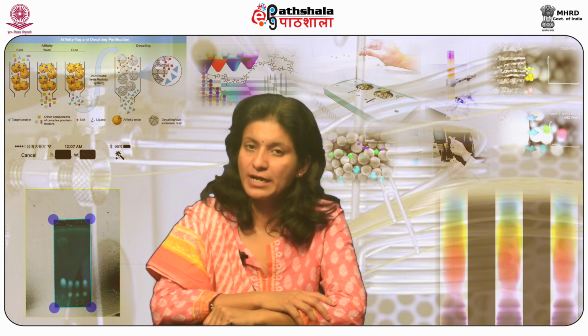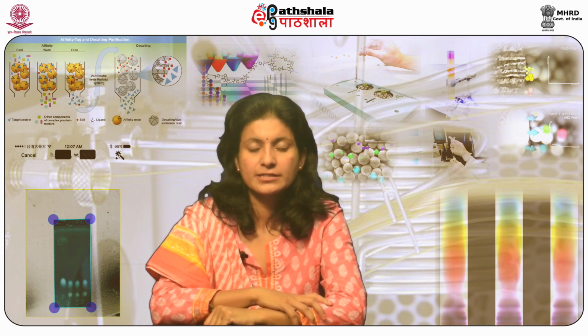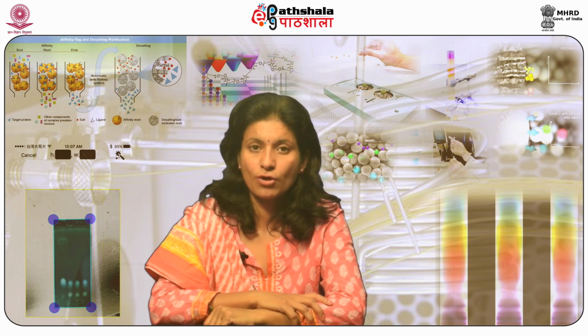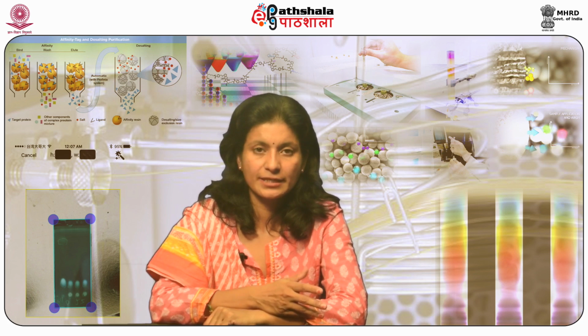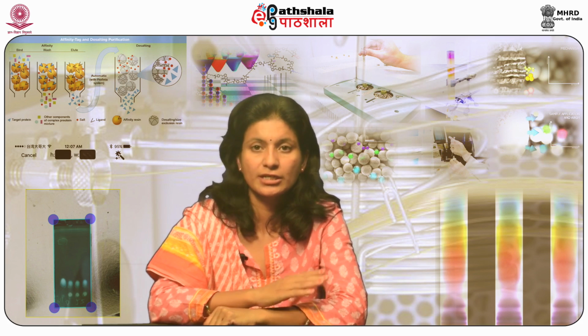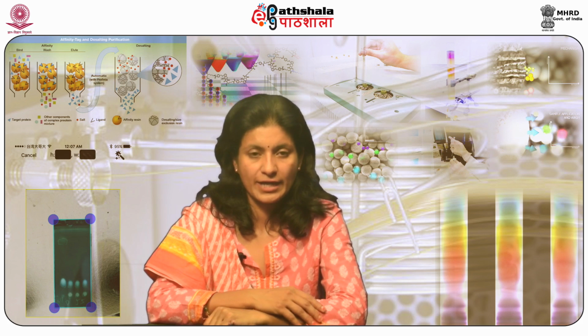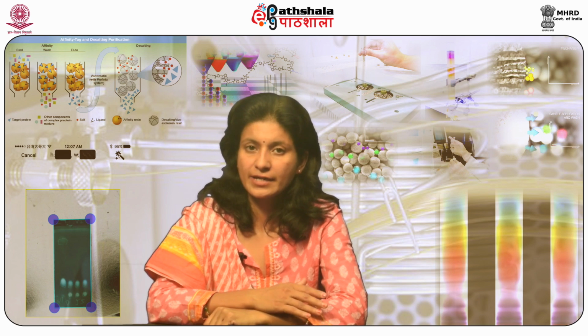Ion exchange chromatography provides a sensitive and authentic analytical procedure and techniques for the evaluation of minimum concentration levels. IEC is a beneficial instrumental evaluation technique which provides reliable methodology minimizing the detection limits. IEC is the most determined approach for the evaluation of organic and inorganic ions.